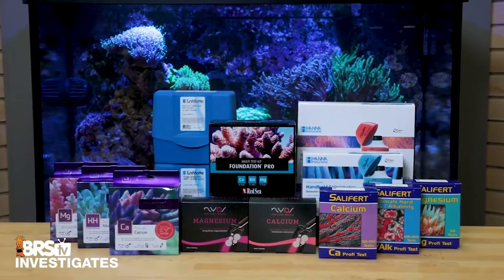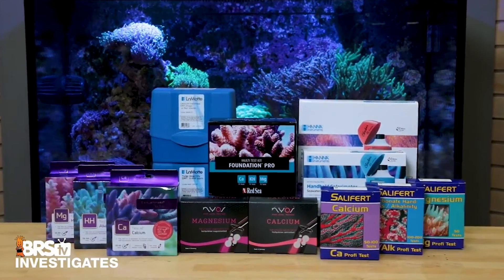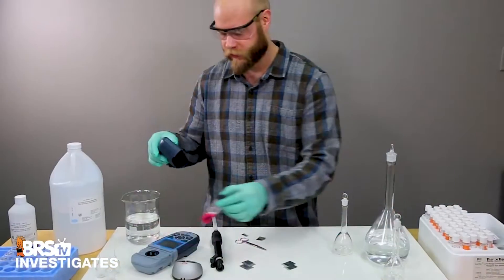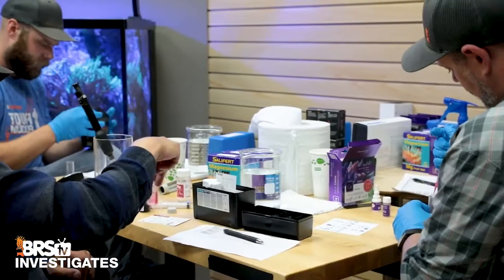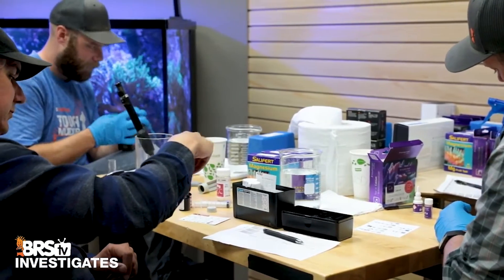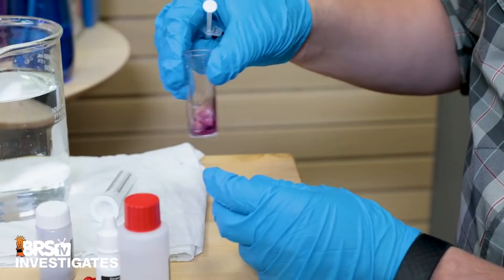The majority of test kits for monitoring calcium are titration-based, and depending on the quality of the components, volume of the sample water that's used, and the starkness of that endpoint color change, some kits can be more difficult to get consistent results with.